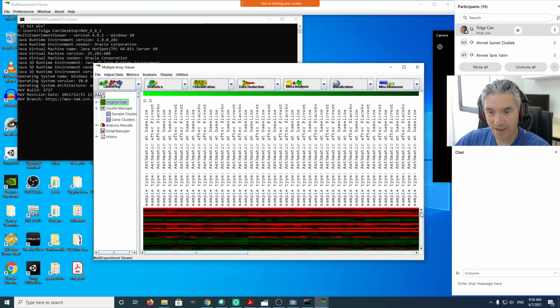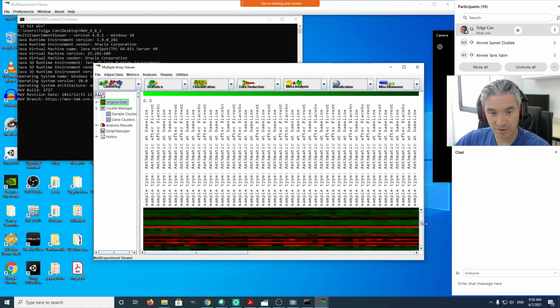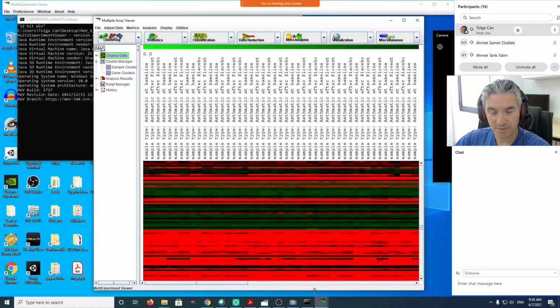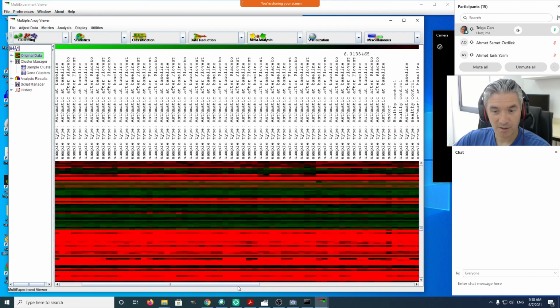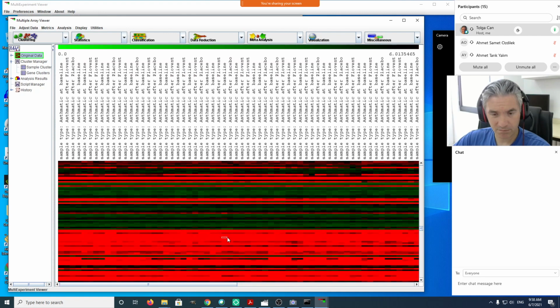All right, so each row you see here corresponds to a transcript, and as you can see, transcripts behave very differently. Let me try to enlarge this a little bit. Some transcripts are expressed a lot, and they are expressed, for example, in all the different types of cells, regardless of their sample type.